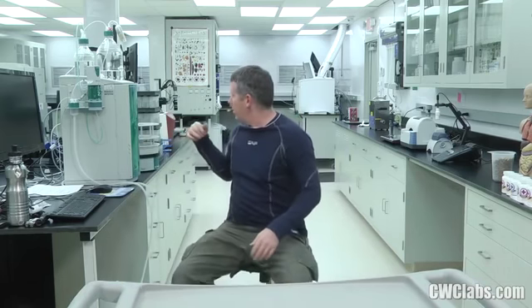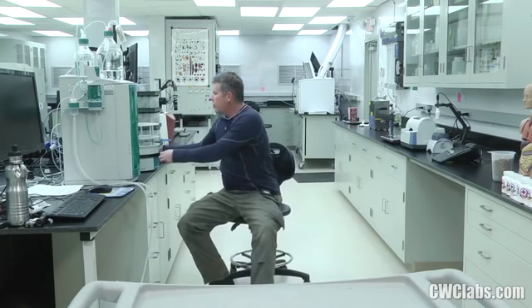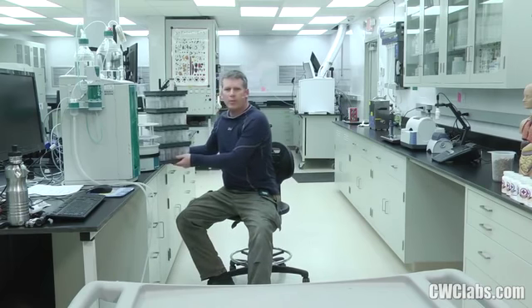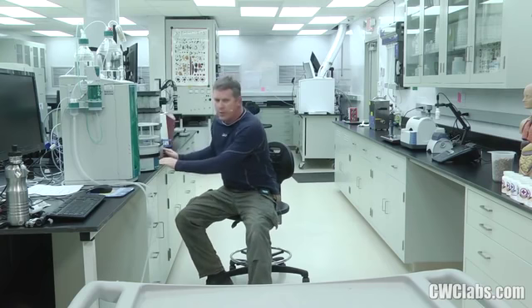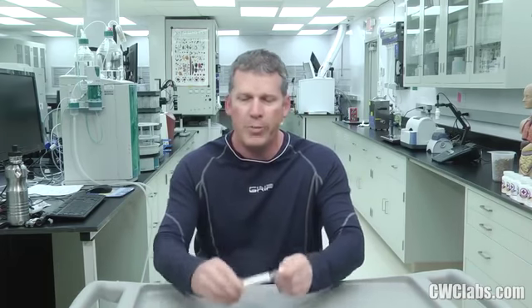I love testing water. I don't know if you see behind me back here. Right here, this is like 100 water samples from across America that were sent in to us, and we're testing those for toxic metals. Basically the same test that we did here. Every sample sent to us is like a mystery sample like this. So we're testing all of those, and we found high lead in one of them near Phoenix, by the way, and that report's about to come out.